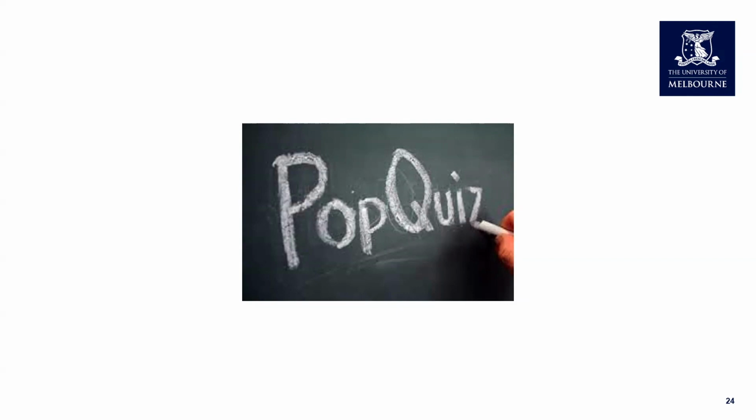For the first question, what is the ideal pixel size for microscopy? It's good that most people got the correct answer. Yes, it has to be at least 2.3 times smaller than my objects, which is correct.